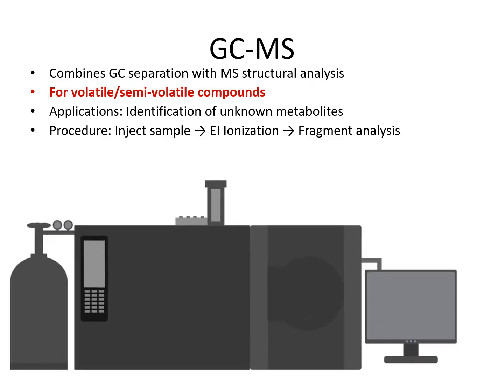So it has a carrier gas which carries the sample and passes it across the column for separation to take place.